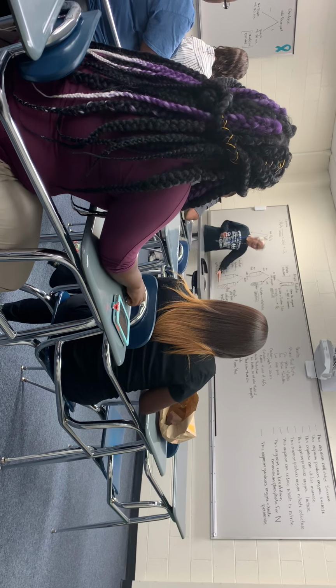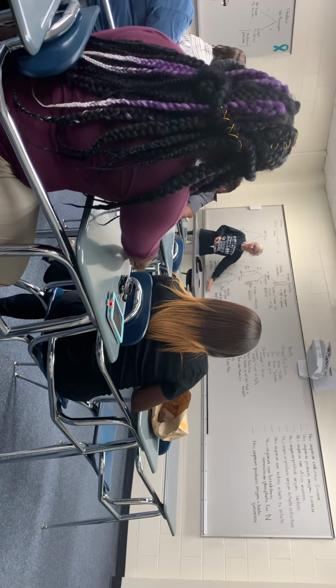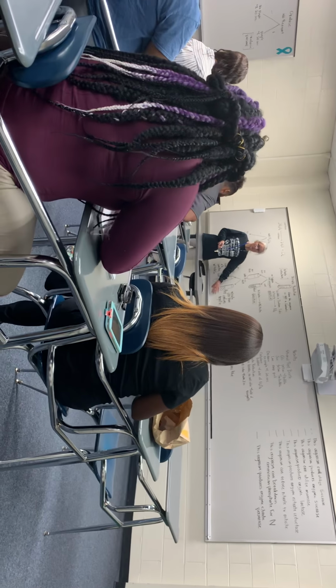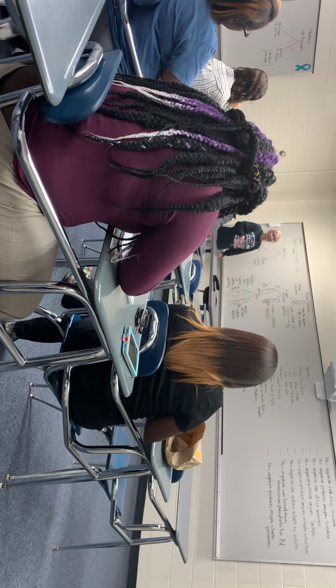So our only negative is when it turns red when you add the zinc dust. So that is the only thing that confirms a true negative test. Okay? So any questions about that one?